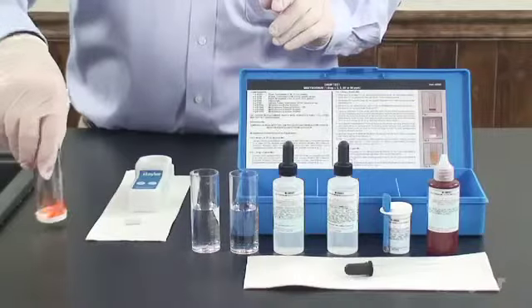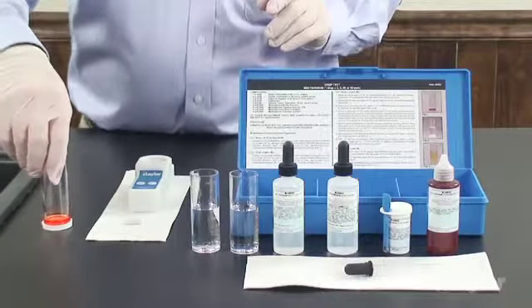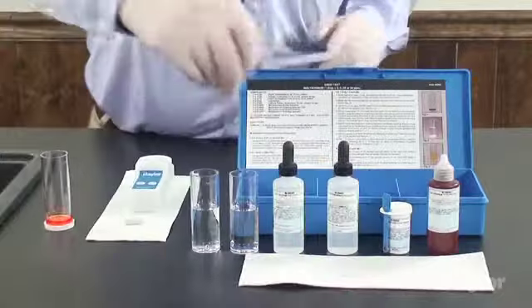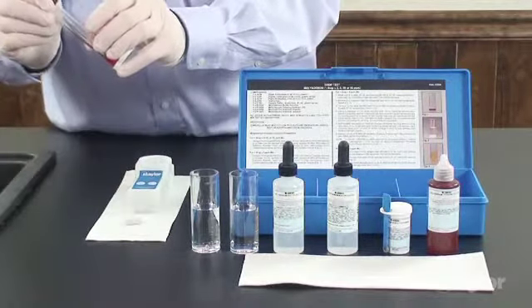Swirl until the solution turns a clear red-orange color. Undissolved crystals will remain in the solvent powder mixture. Note: this indicator solution is usable for up to 24 hours after it's been prepared.